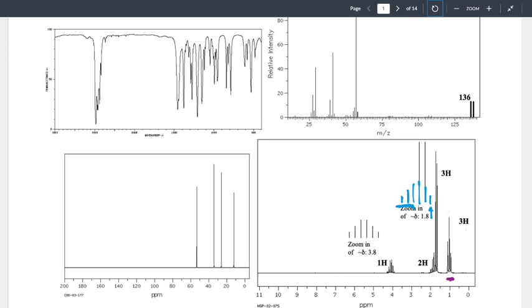Make sense? We're now trying to maintain internal consistency. My CH3 still has a CH2 next to it, but I don't know what's next to that CH2. Blue tells me my CH2 is next to a CH3 and a CH, so it's added a little bit more information. We've removed some duplication. All right?